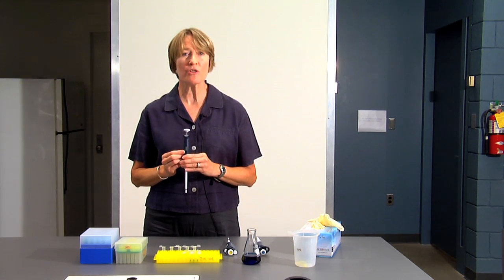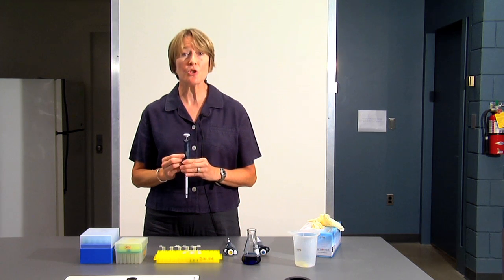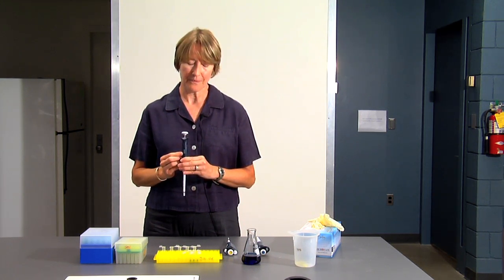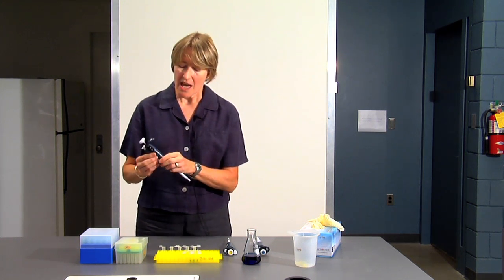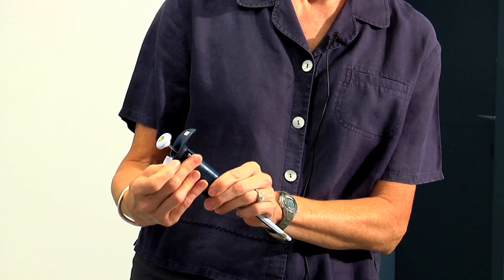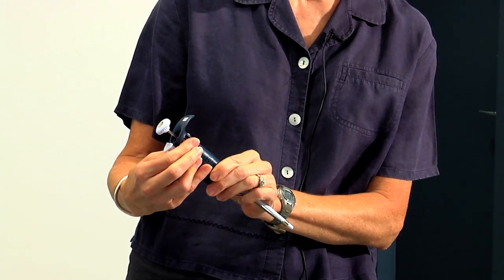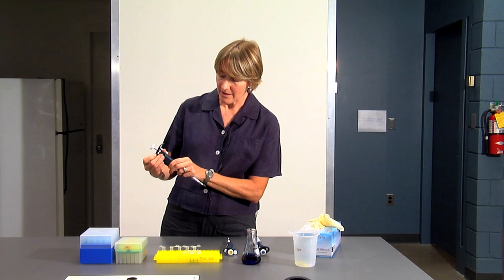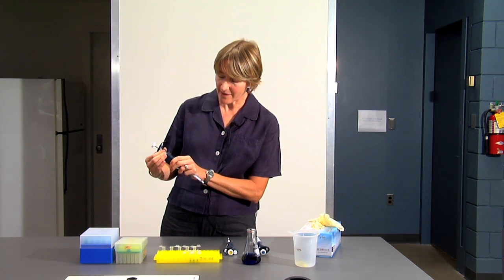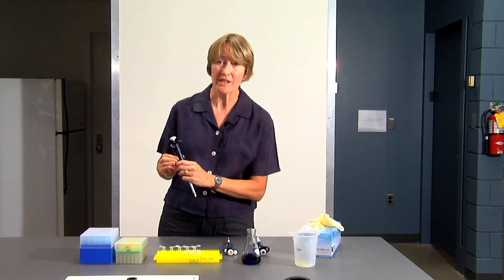If you wanted 200 microliters, you would set it at 200. 50 microliters would be 050. To set the pipette, you turn the barrel until the numbers appear in the window for the volume that you want. So I'm going to set this at 100 microliters or 100.